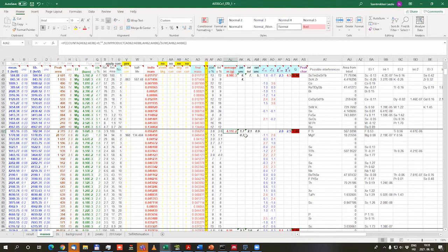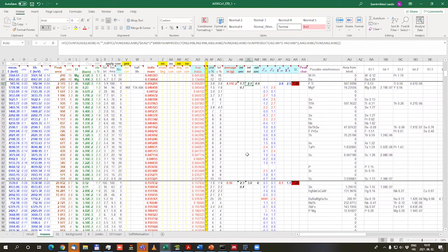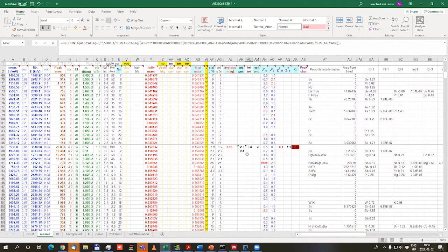And the other thing you have to notice is that we have here a lot of lines which have 6%, 8%, 7% statistical uncertainties. And by doing the weighted average, this can be reduced to about 1.7 or 2%, depending on how you calculate. And this is a key step to make the analysis results precise, because this way the statistical precision of the analytical lines can be much improved.